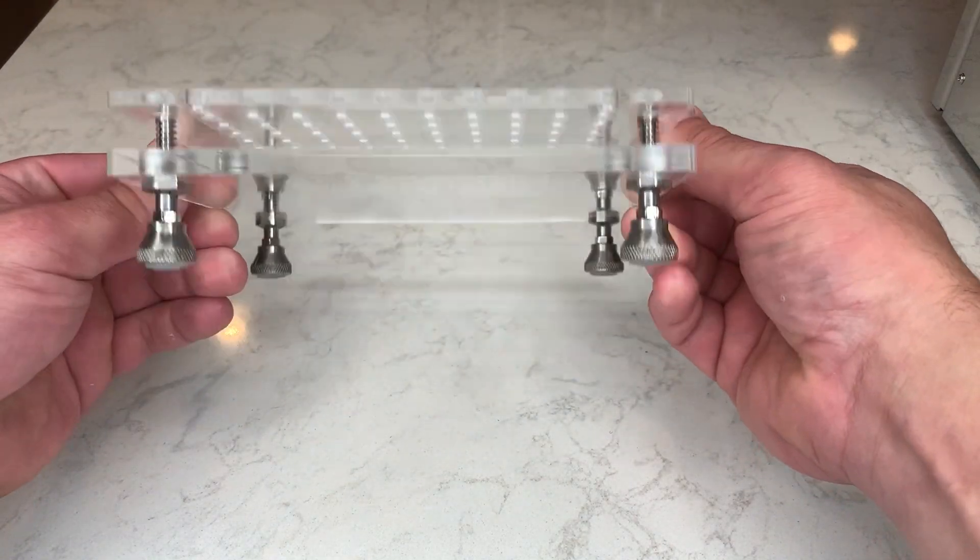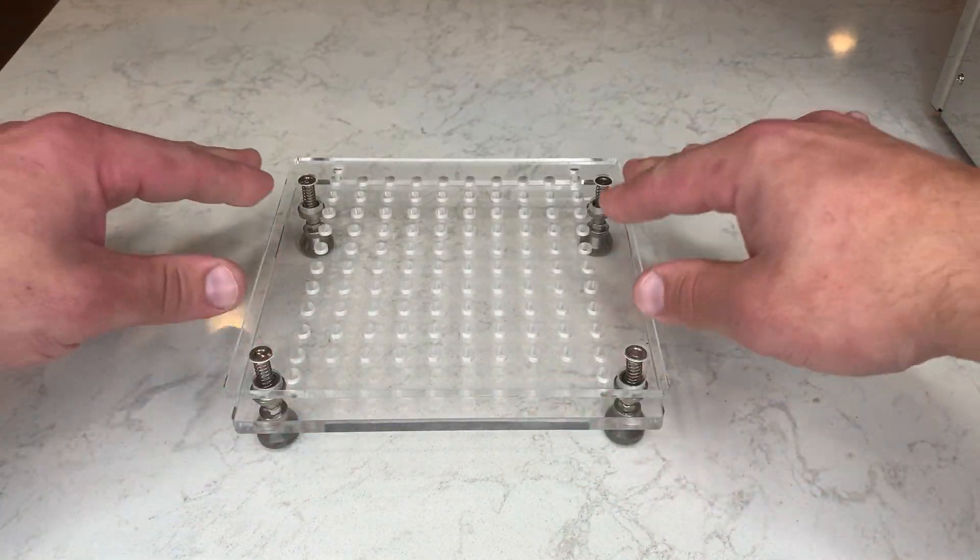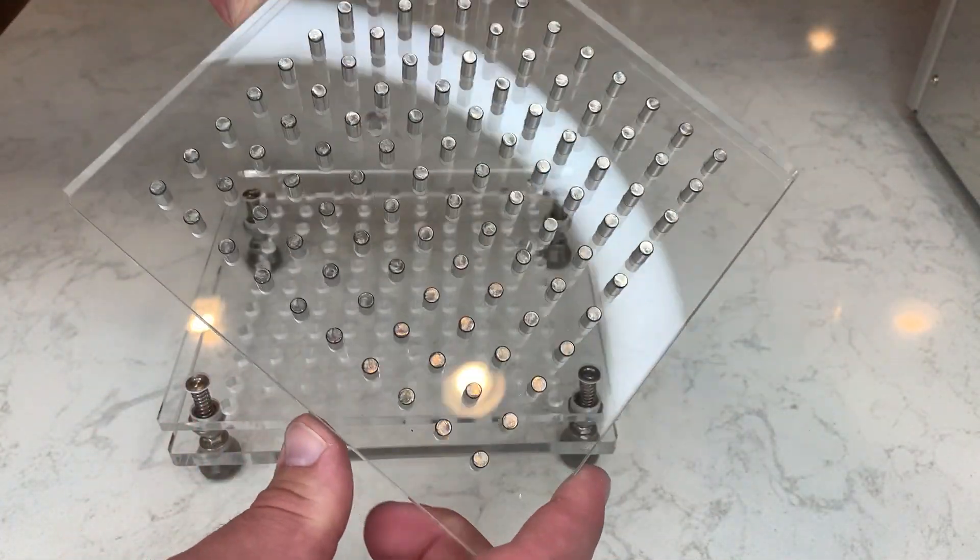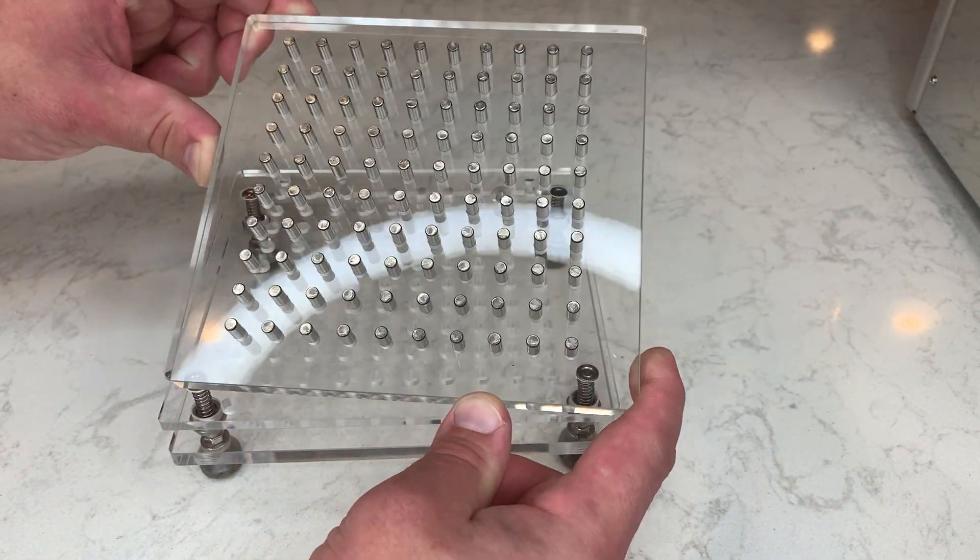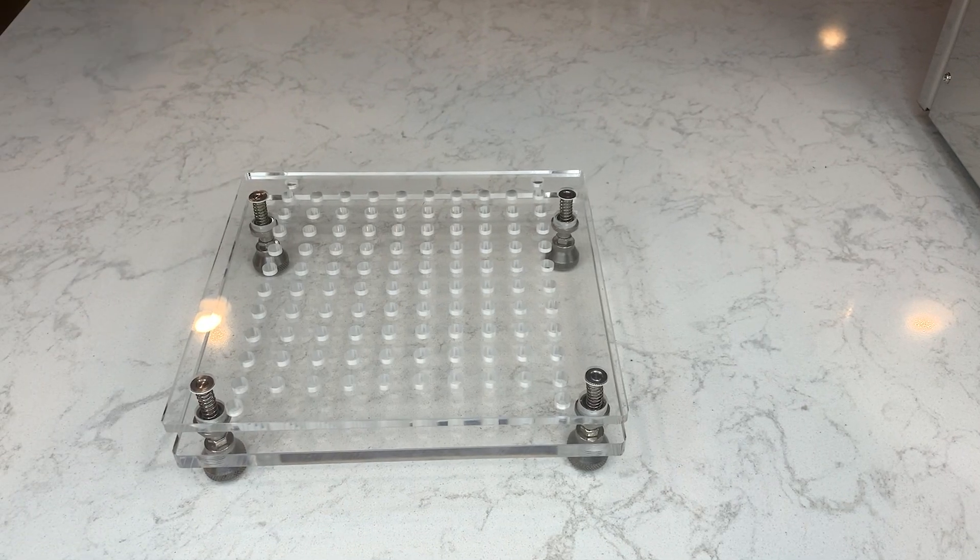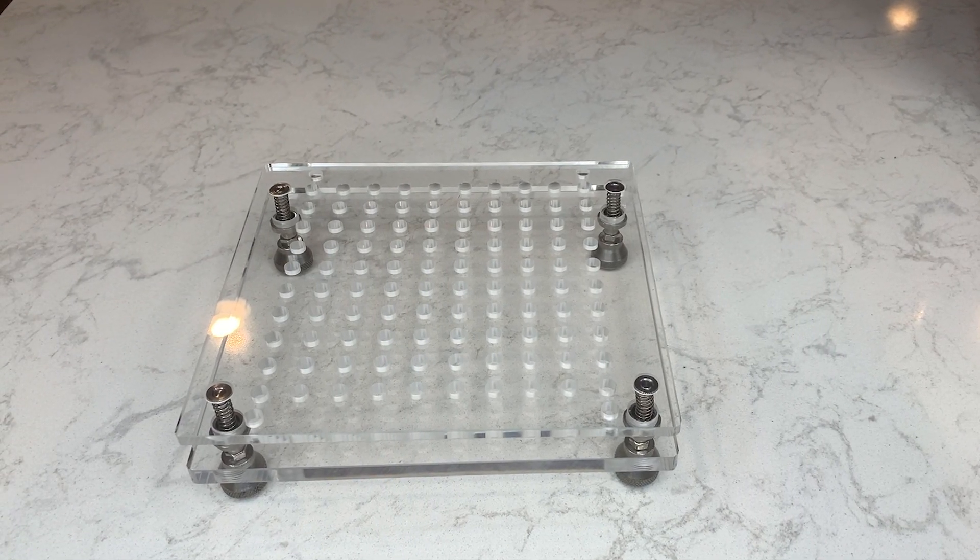These are made of full acrylic and stainless steel. They have rubber feet, so it doesn't move, whereas the plastic does. Unlike the first series, the metal pegs are engineered into the acrylic, making a seamless single piece. The machine's hardware also lets you take it apart for quick cleaning or adjustments without using tools. This also comes in capsule sizes 4 and 5, which are highly specialty.